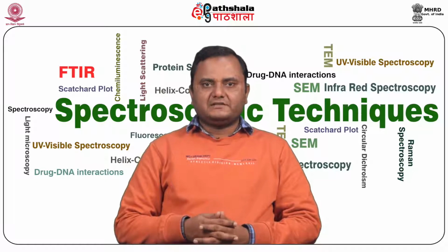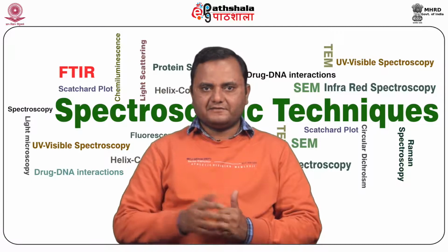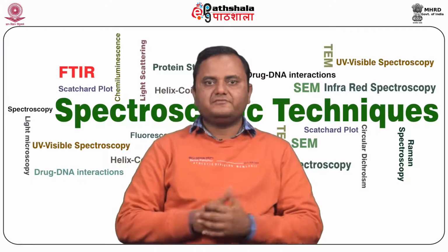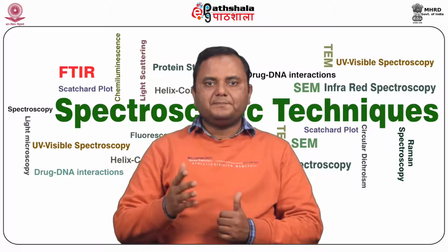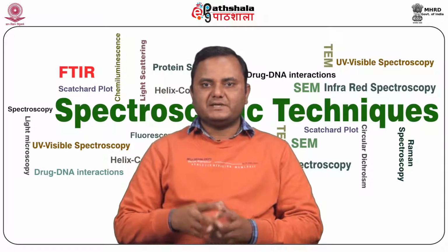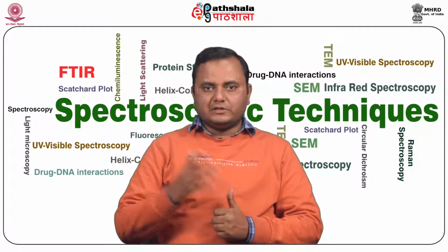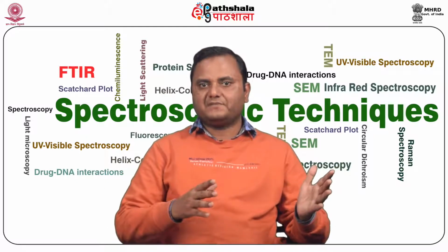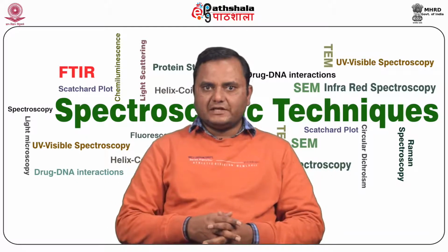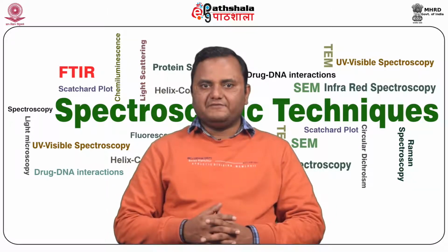A positive Cotton effect is where the peak is at higher wavelength than the trough, and the negative Cotton effect is the opposite. So optically pure enantiomers always display opposite Cotton effects in the ORD curve for identical magnitude. If you have the L or D configuration, they show equal and opposite Cotton effects.